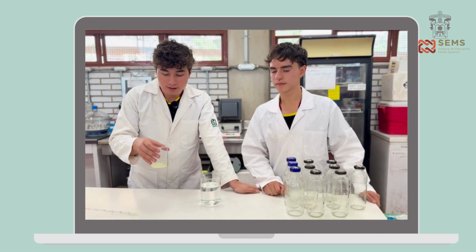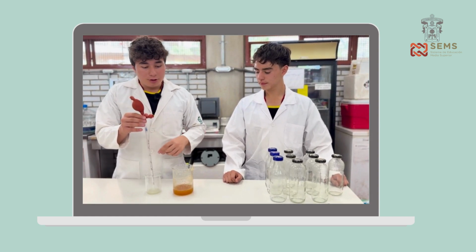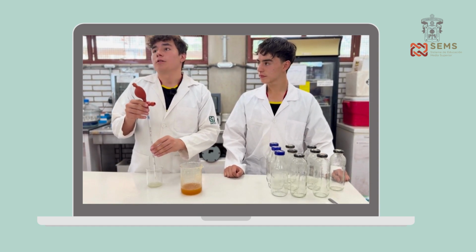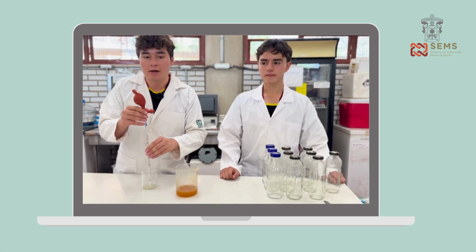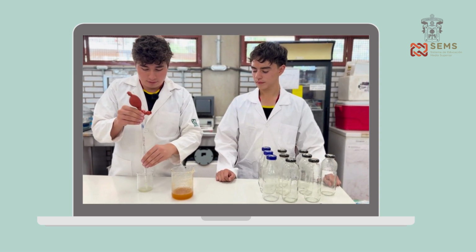Currently, what I'm doing is mixing the cinnamon oil with the double distilled water. So, now for the honey mixture. What we'll utilize here is honey that's 100% natural, right? And here, what we'll do is a concentration of approximately 98% honey and 2% cinnamon oil, with the mixture that we made before.